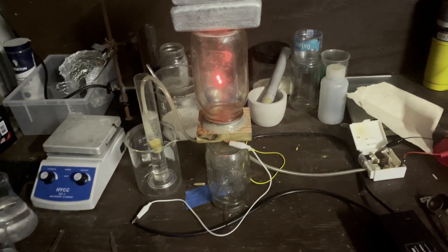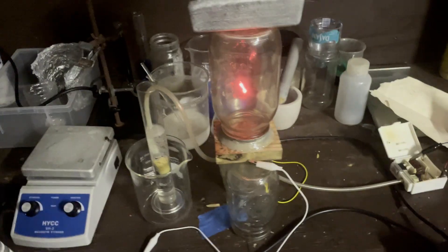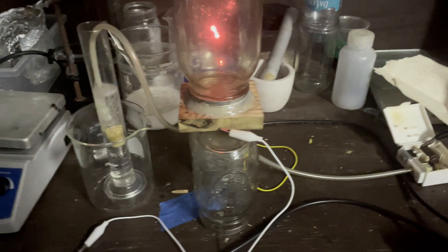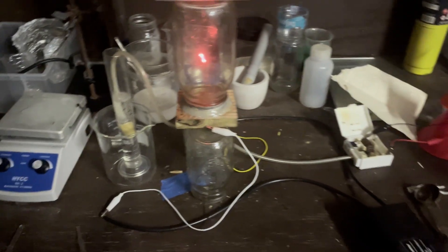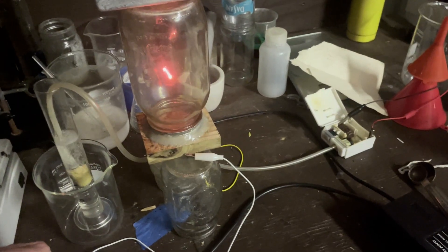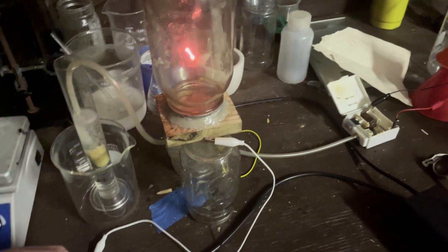Over two days, I have run this thing for 10 hours. It has melted down my electrodes a little bit — kind of cool. It should be acidic now. I'm going to stop this and run a distillation on my solution, distill it down into my nitric acid.